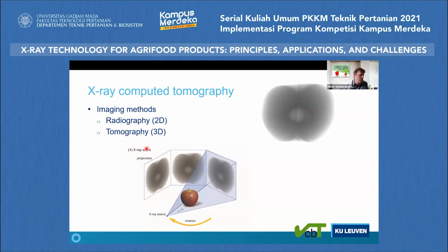If we operate it in tomography mode, which means that you're going to rotate, like in the medical scanner, you rotate the X-ray source and the detector around the object, and you take a lot of pictures, hundreds of X-ray pictures, as exemplified here. I only showed 3, but you need a lot more. Or, when the X-ray source and the detector are stationary, you can rotate the object and do the same. And you take a lot of those radiographs, and then magic happens by the use of physics and computer science and mathematics. You can recompute the object.